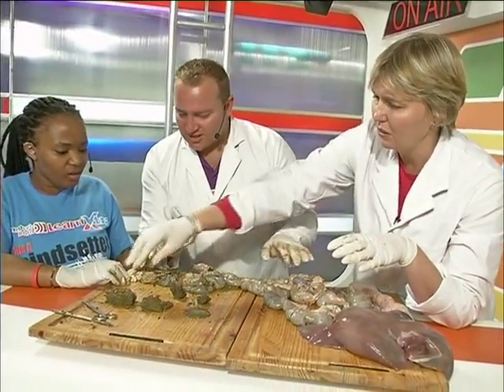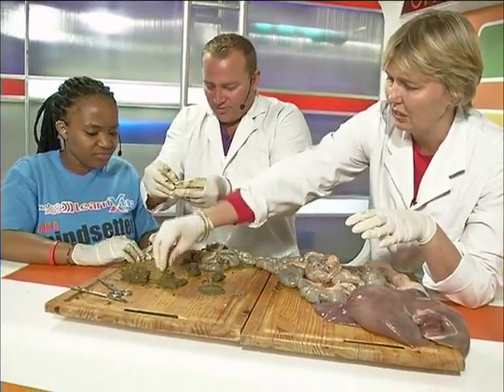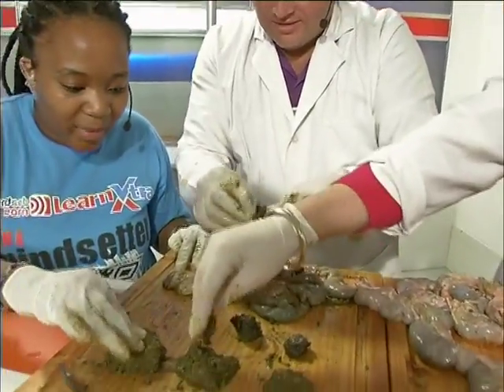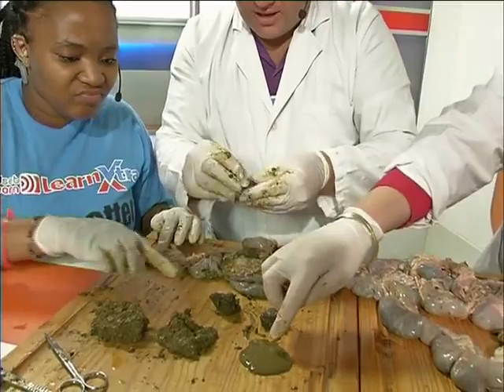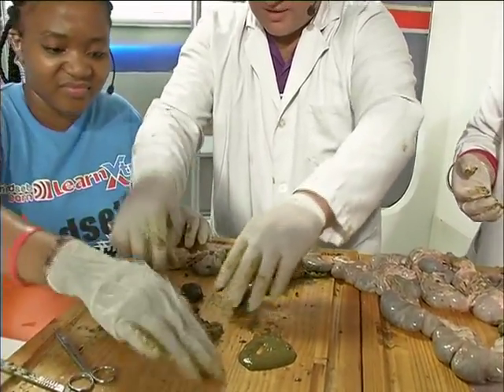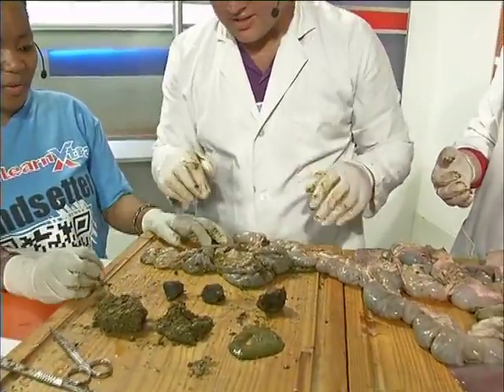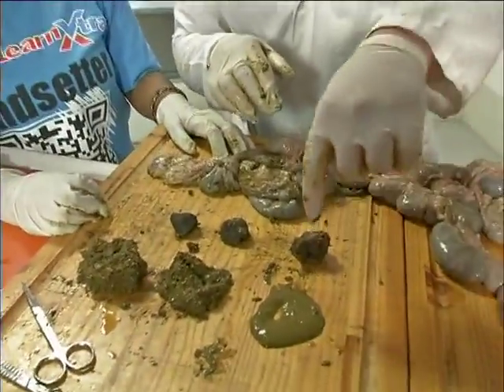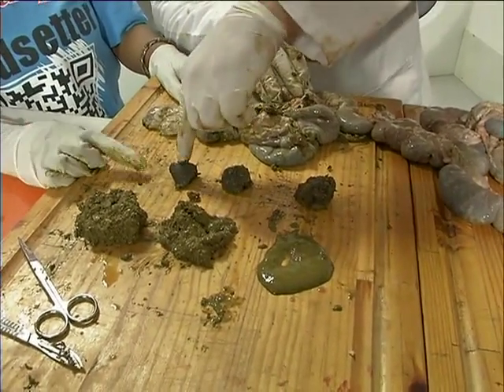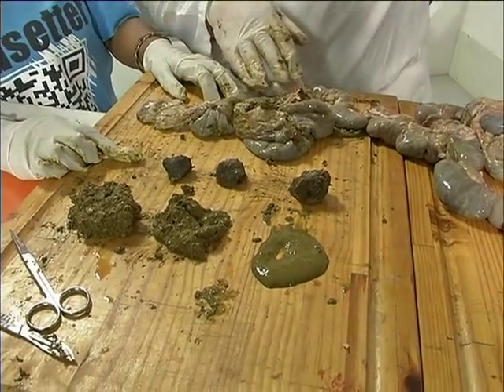Yeah, this really is hard. Okay, this one has almost no more liquid in it. This one smells really bad, and then this one is better. And this one probably smells the worst. Okay, so mind your mouth. That's how it goes. It goes from a liquid as it comes in, and it takes less and less water, almost nothing, and then it drops out at the end, which we've still got.